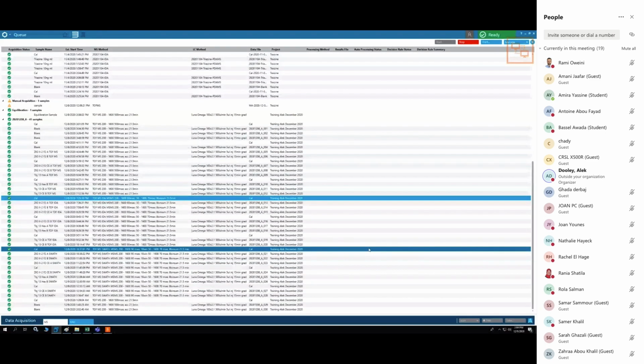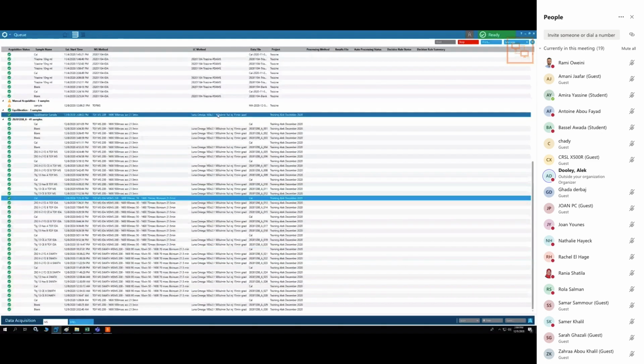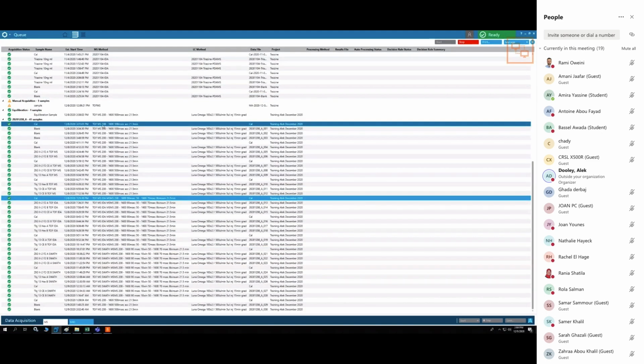We were recommending to customers to do that every day, but we found that people were using the calibration mix quite a lot. So I changed my opinion, and I now say you should do it every 3 or 4 days. However, I was not really aware that the instrument had not been used in such a long time.